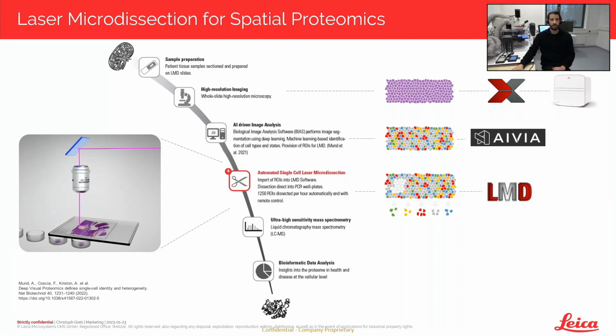As I said, the imaging device can be any imaging device. It could also be Mica, as I pointed out in this picture here. It could also be the LMD device itself, or just any other kind of imaging device. From there, we go in the workshop back to the LMD, because the Aivia software is at the LMD. And afterwards, again, we stay at the LMD where we do the dissectation then. The central point between the AI software and the LMD is XML. So the language both softwares are speaking is XML. So that's why we will have a short look at this.